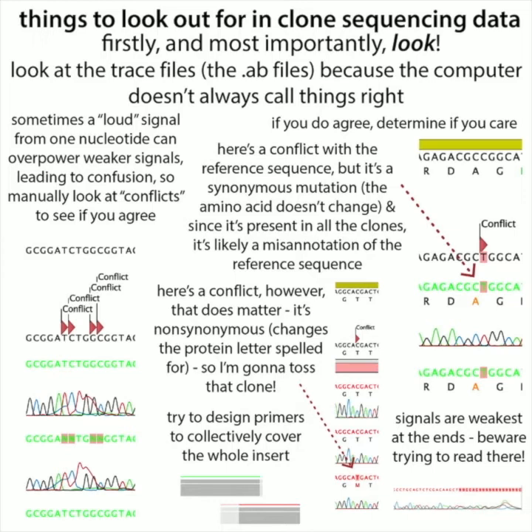that you then compare with the sequence that you expect to see. You're looking for conflicts, where there are any mutations or differences between your sequence and the sequence that you want. You especially want to be careful about the ends, where you cut and pasted it in, and make sure that the ends are all good.